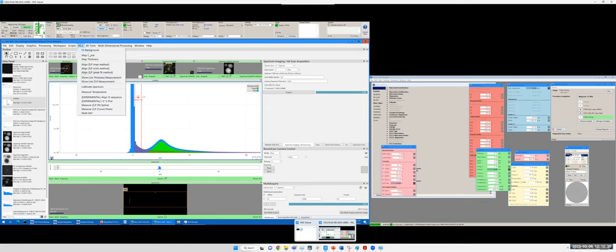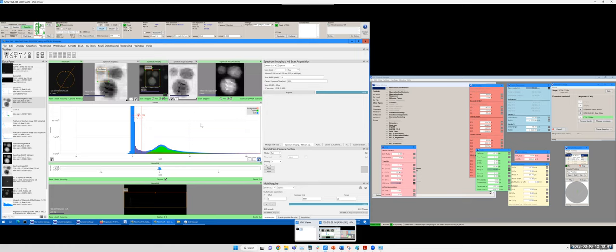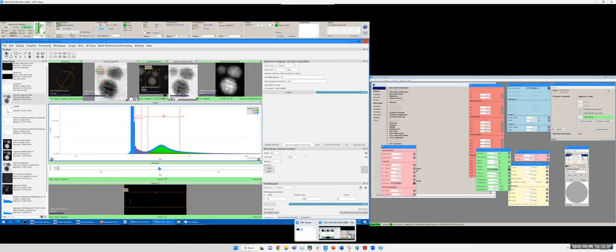Okay, use a map signal. Okay, we can do a signal map. Okay, here. Yeah, this is a map of the signal. Yeah, it's better to process it in Digital Micrograph because this is not very well designed, but it provides you some functions already.